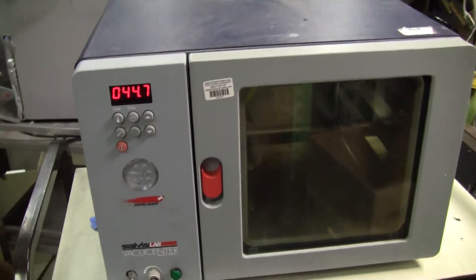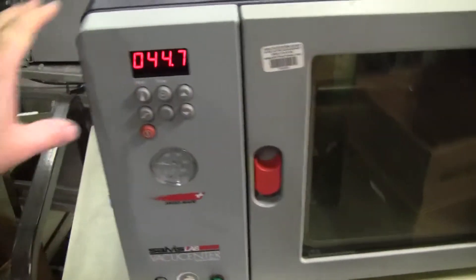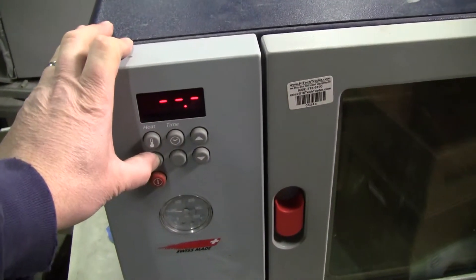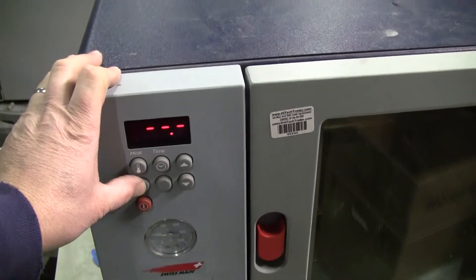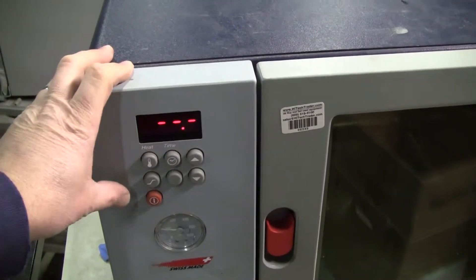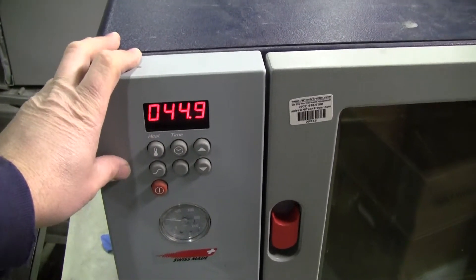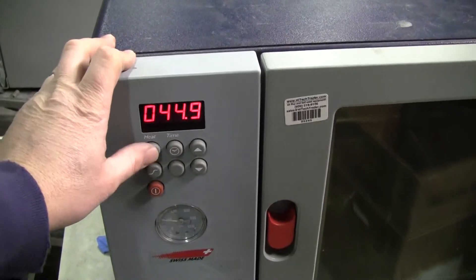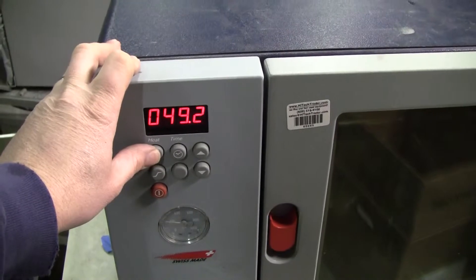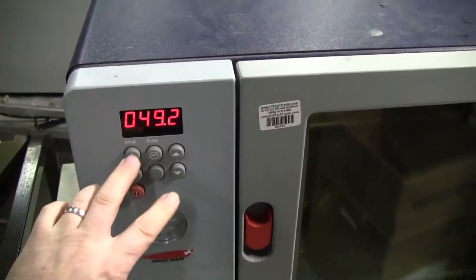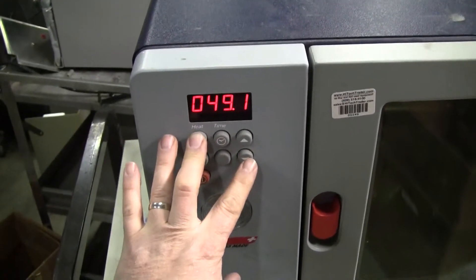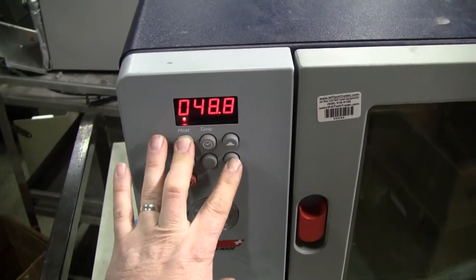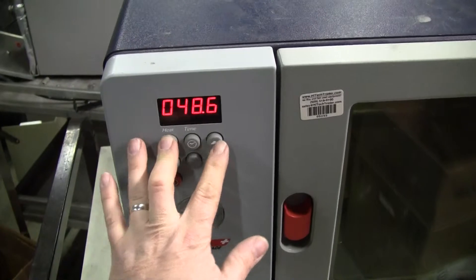Looks like you could maybe do a ramping step up here. Set a time and have it ramp up to a different temperature. There's set point, set point, set is up and down from there.